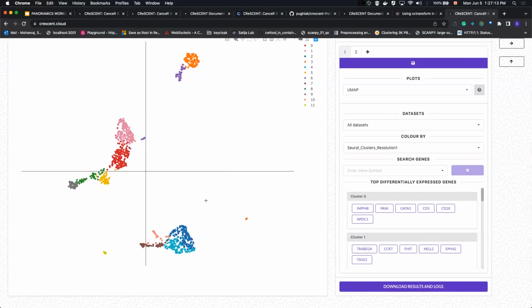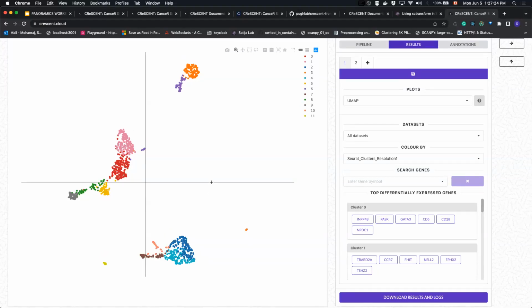And so that could be an indication that these groups are different from each other. These could be different types of immune cells or blood cells because these are PBMCs. But within that group of immune cells, for example, we can see this separation of function and gene expression. So let's say we had our favorite gene. We're looking for a gene when we're exploring this data.